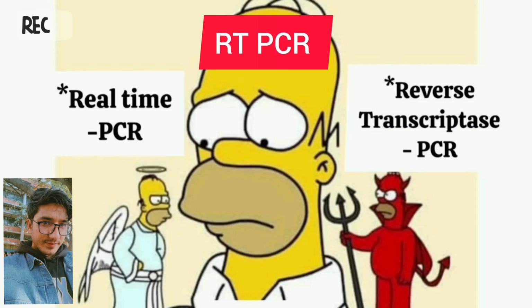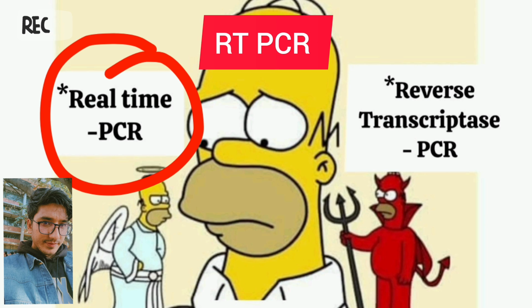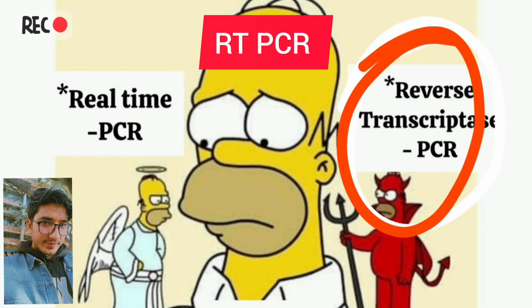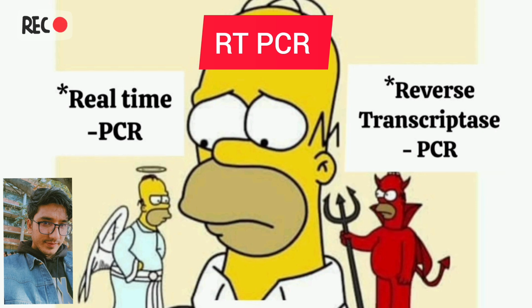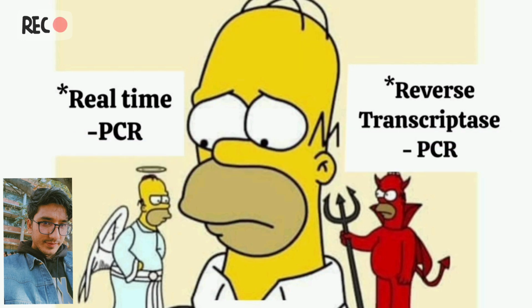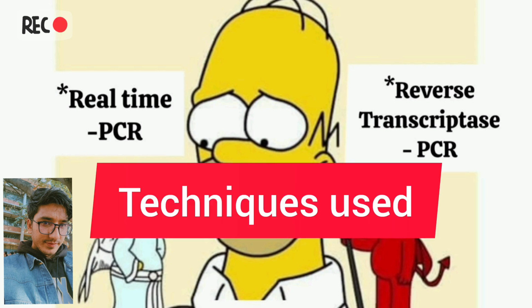So today in this lecture we are going to talk about RT-PCR. What does RT-PCR stand for? Many people get confused between real-time PCR and reverse transcriptase PCR. Generally, RT-PCR is used for both of these PCRs, real-time PCR and reverse transcriptase PCR. What are the techniques used in real-time PCR, and what actually is reverse transcriptase PCR?